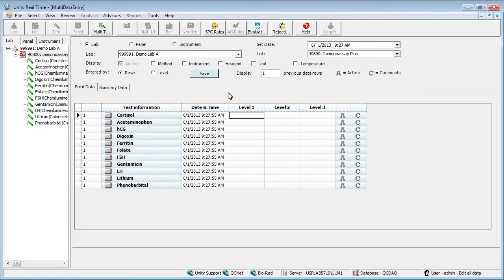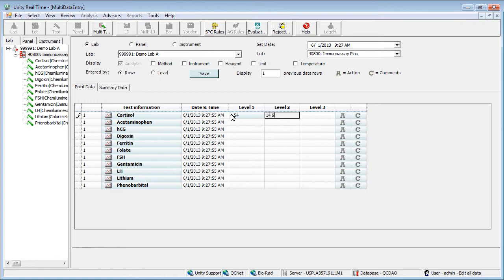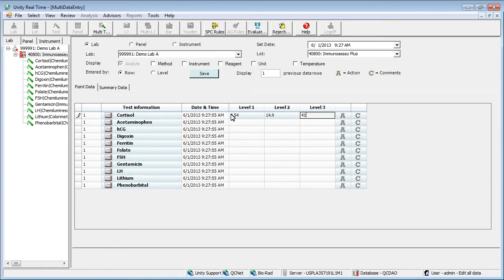Enter your first value for the first test. Press Tab to move to the next field. Continue entering data for each test. Then click Save.